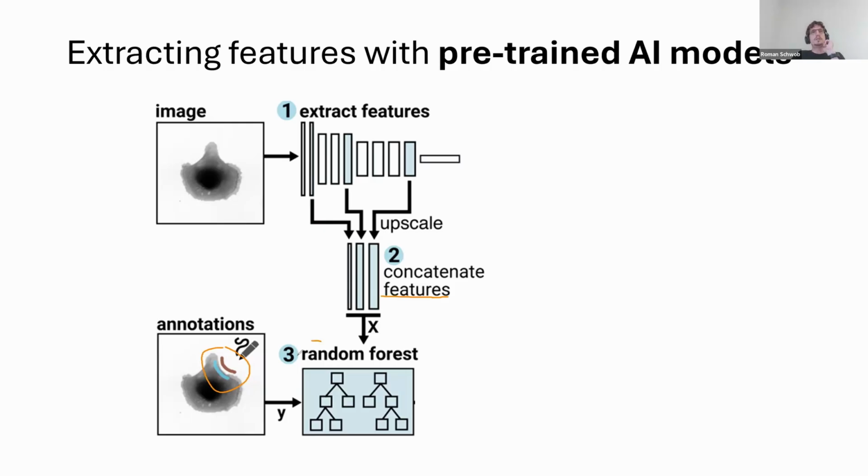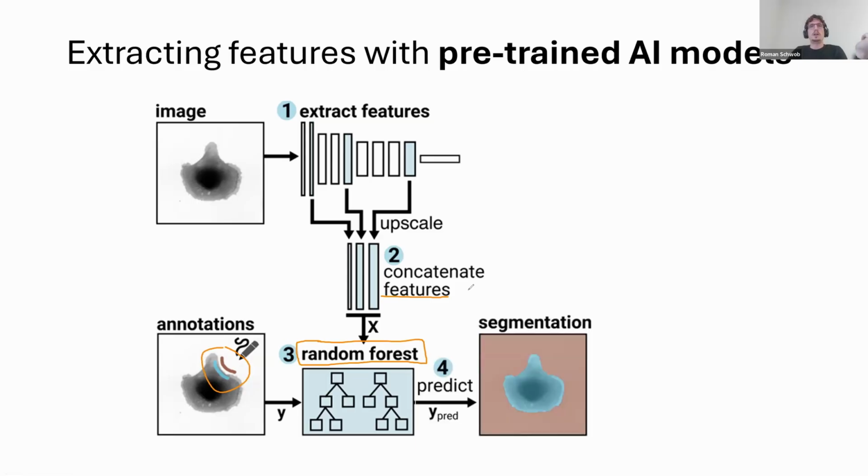We feed those into a classifier, and this classifier can then learn which features should be represented with which class. And when we train this classifier, obviously we can apply the trained classifier on all the pixels in this image or also in a new image. So we can use it later on different images.